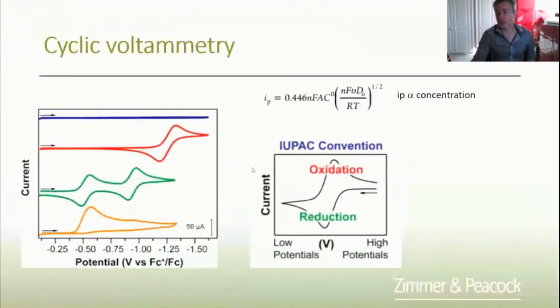But what we wanted to do there was, we did a lot of talking about cyclic voltammetry, and a lot of talking about screen printed electrodes and small instruments. And it's fair to say that Andre did that experiment in the space of about 3 minutes, and it's really that straightforward with electrochemistry. I think in a lot of sciences, it's months of setting up experiments and no results. Yeah, it can be like that in electrochemistry as well, but you can also get quite a fast return on your efforts.